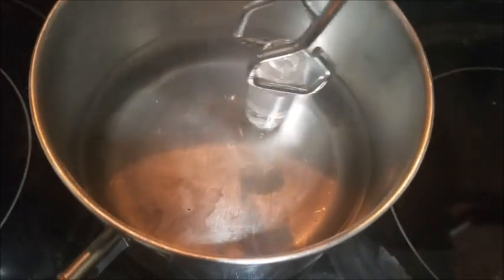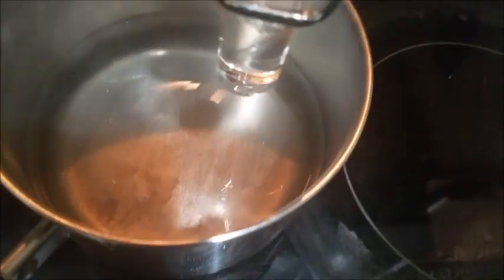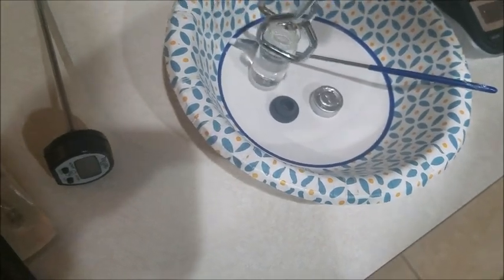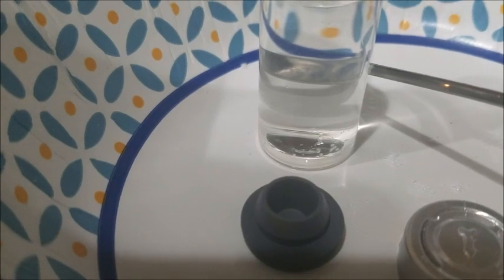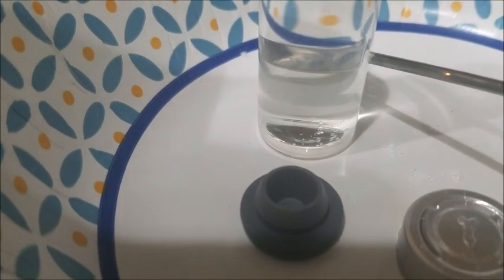Now we're ever so carefully going to take this out of the water. This is our complete solution. And we're going to set it down. Oh, there we go. And we're going to look inside. And if you look inside, you'll see all the white powder is completely dissolved into the liquid.